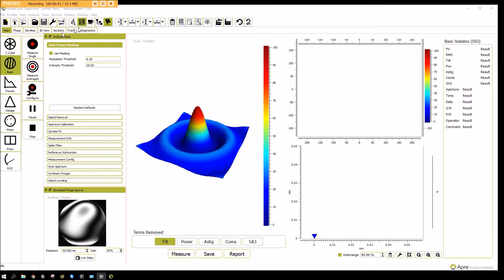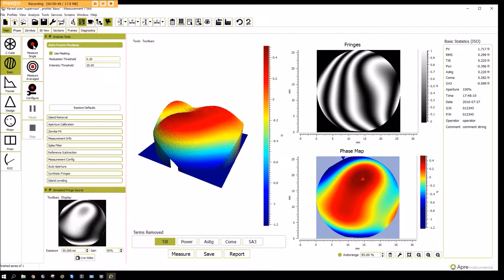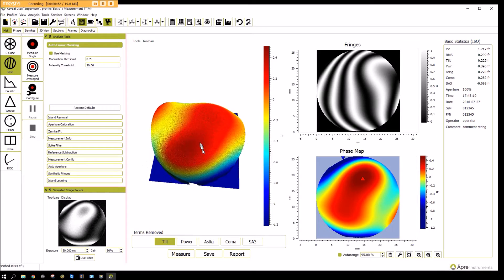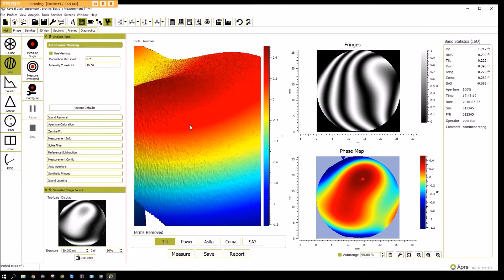To make a measurement, the measure single is clicked. In this case we have some simulated data in the computer, and it calculates the results.